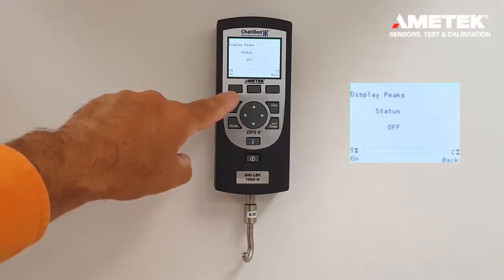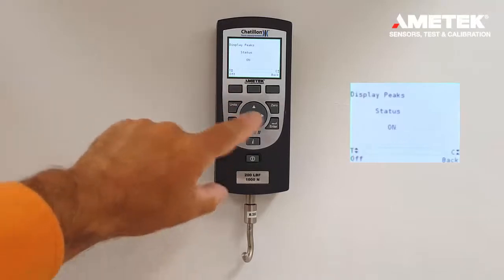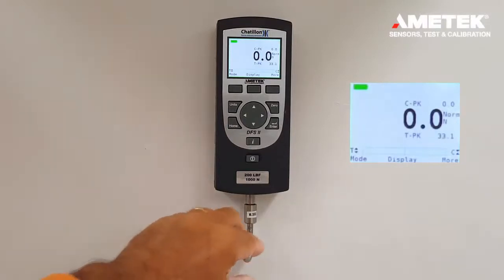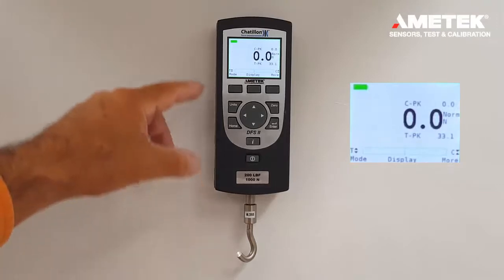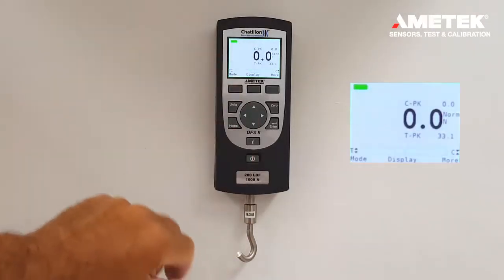Then, press the F1 button on to turn on the peaks. Then, you press the home button. Now, this allows an operator to visualize the main load but still record peaks in tension or compression.